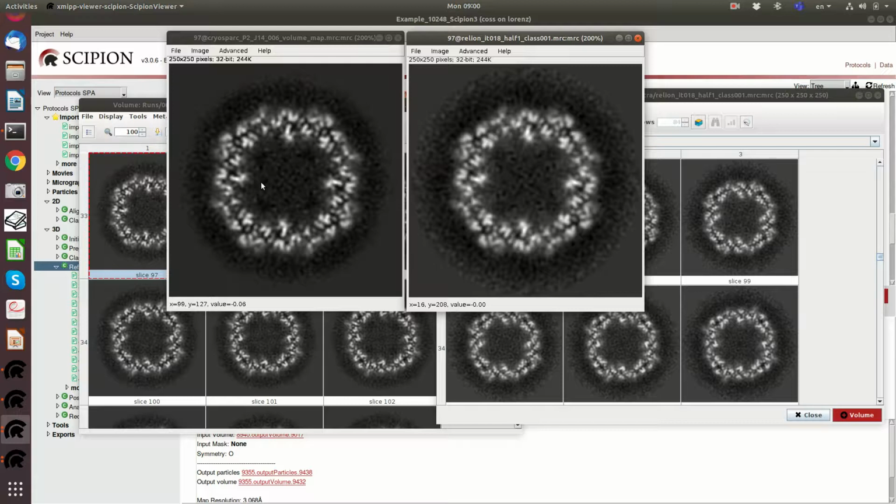These badly aligned particles are smearing out in the 3D process because they are averaged, but the average is not zero. It is different from zero, and this is the low frequency signal that is on top of our 3D structure.